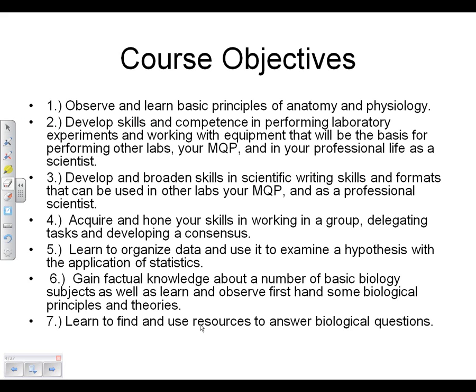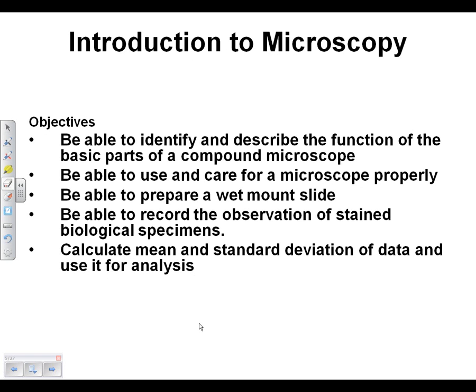And what we'll do now is move on to the background. The course objectives, Ali will again hopefully cover. If we don't, it's in the syllabus. What we want to do is move on to actually talking about what we're going to practice this week, which is the introduction to microscopy. We want to do this because no matter who you are, if you're going to continue in anything related to biological science, you're probably going to have to use a microscope for something. So now is as good a time as ever to start learning how it works, how to play with it, how to get the best view out of it.